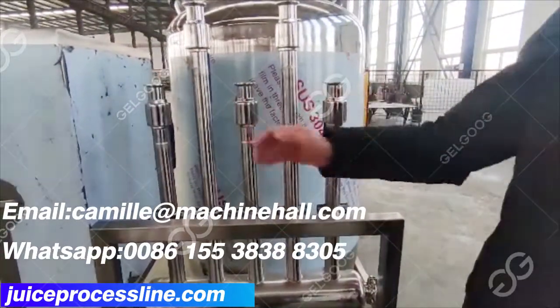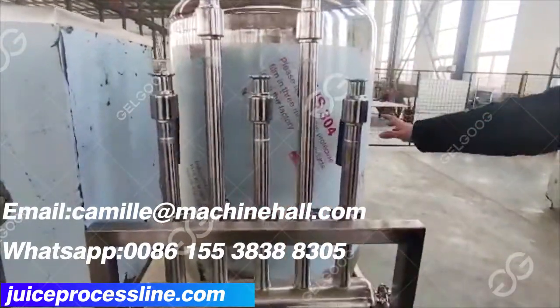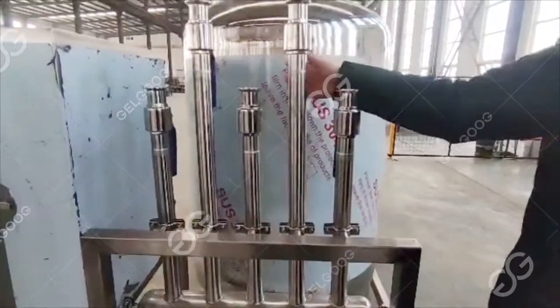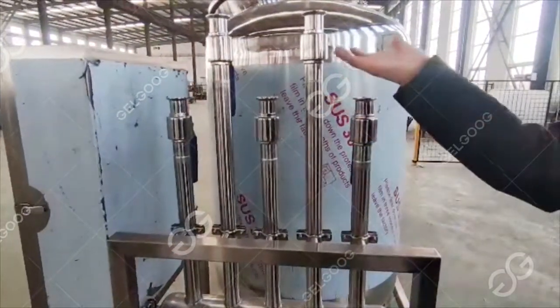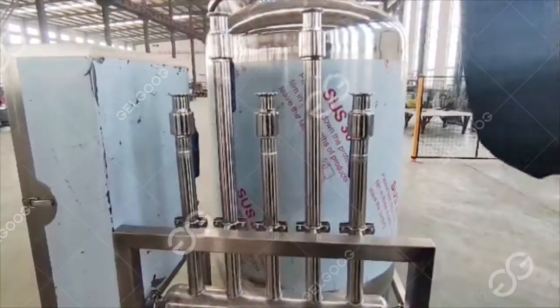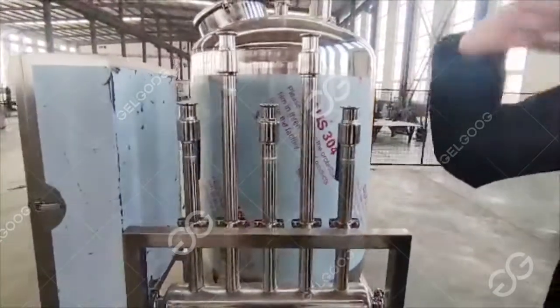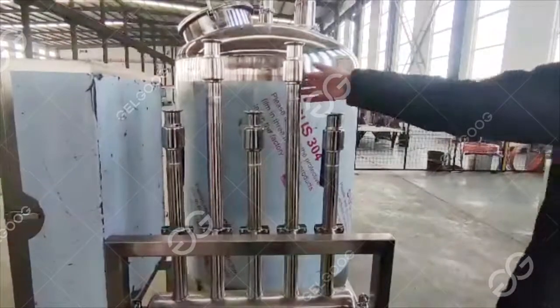That is to say, when you need to clean the equipment, at this time, we first open the corresponding valve, and then open a valve of the corresponding equipment. At this time, we turn on one of our centrifugal pumps. Then we can use that pump to pump one of our cleaning fluids into our corresponding equipment. There is a cleaning device in the equipment, which can be used for this equipment.